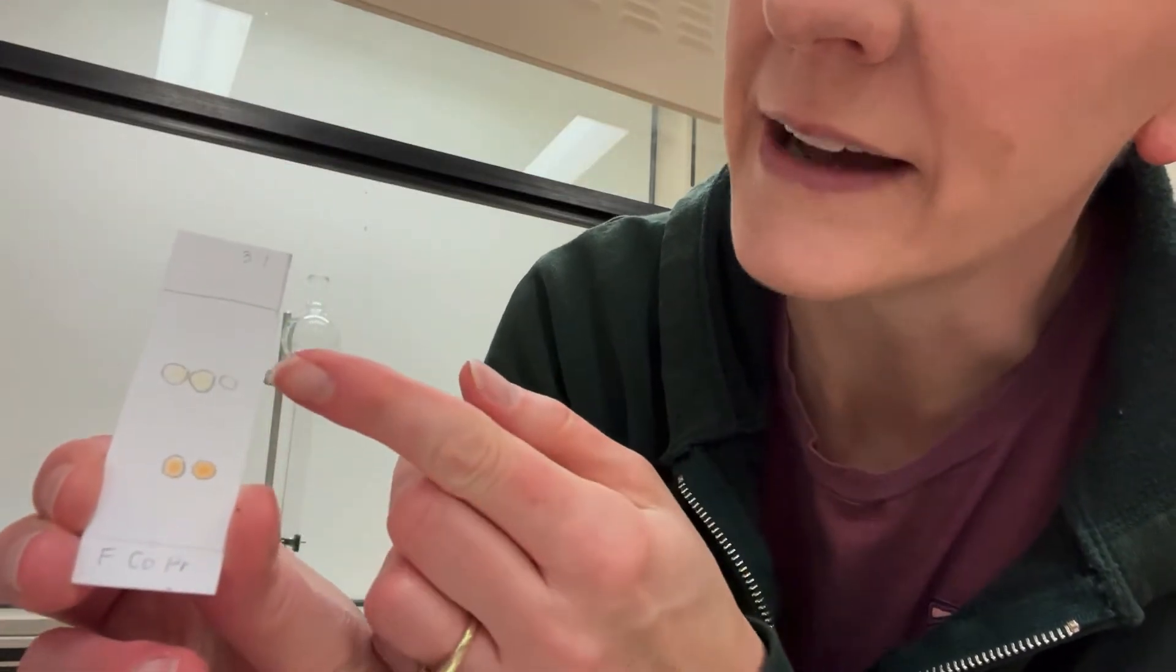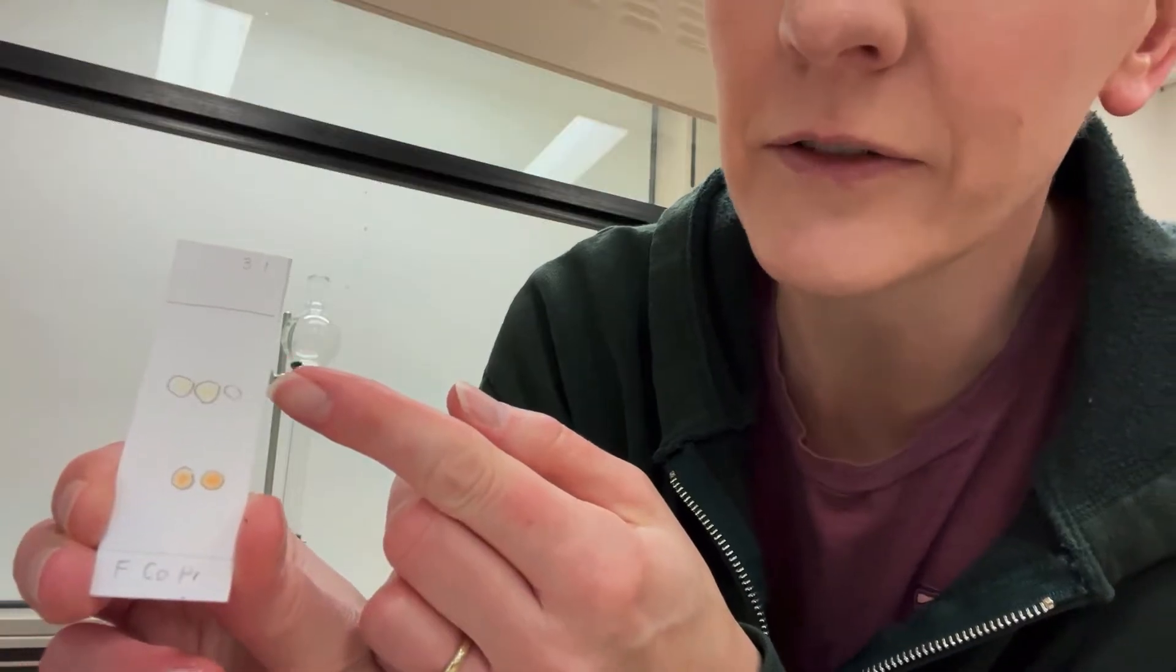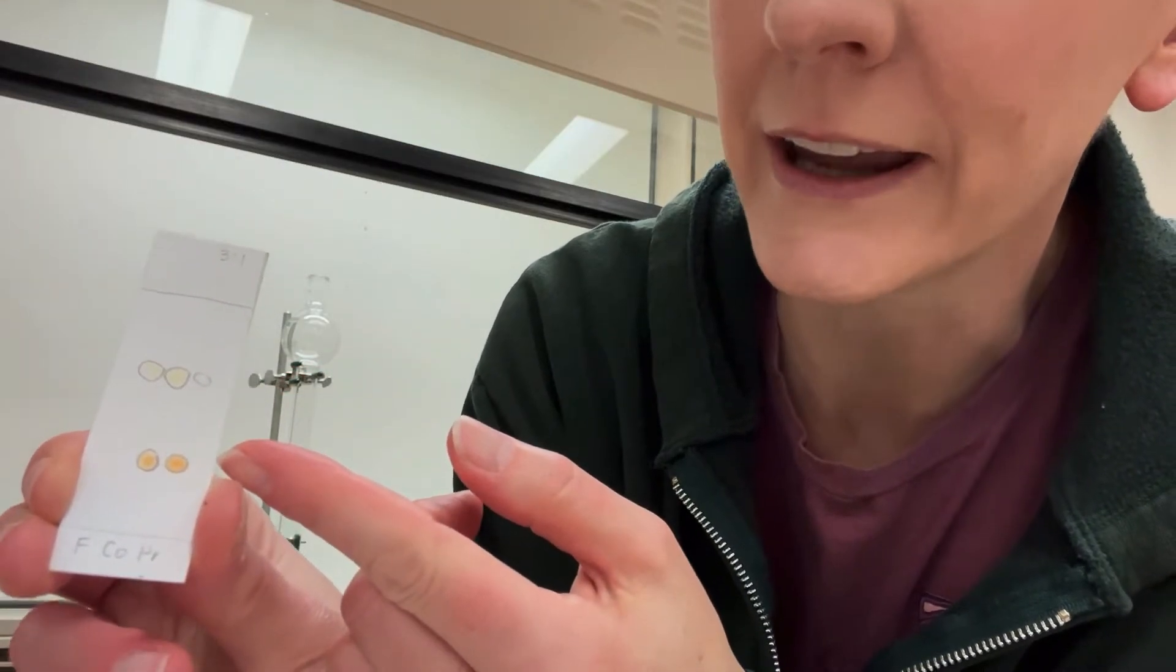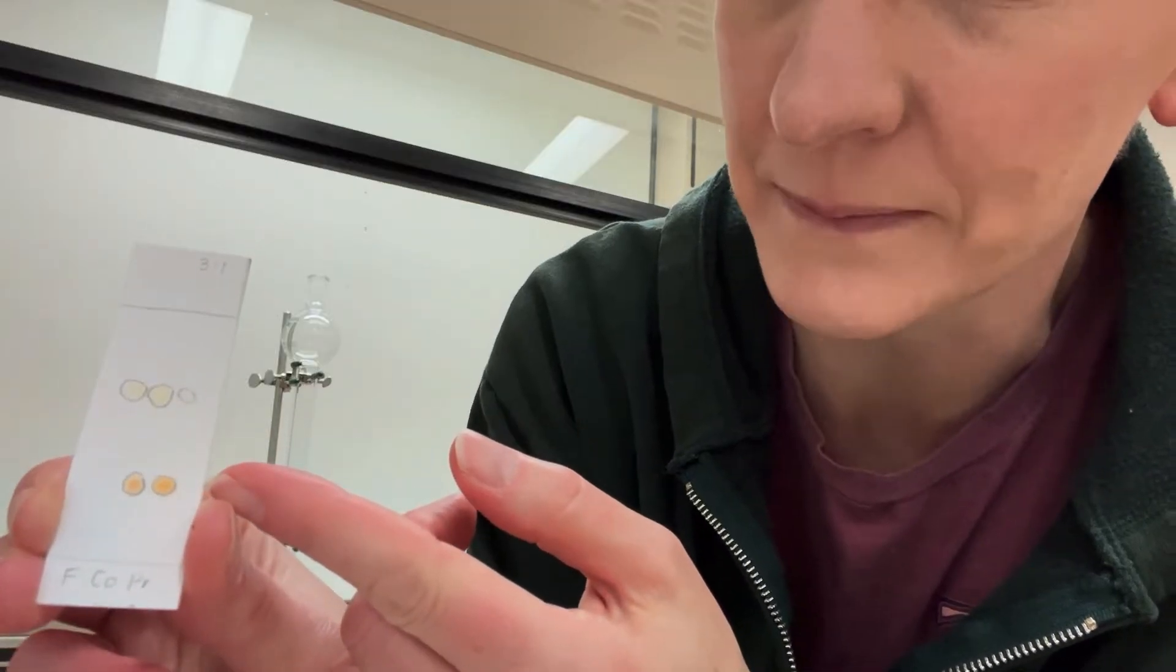So the TLC looks like this. In this lane I spotted ferrocene and that's that yellow compound up here. The middle lane is a co-spot and the other lane over here is the product mixture. If you notice, I have a small amount of ferrocene that's left over. That's what I'm going to be trying to get rid of and this spot is what I care about. That's the acetyl ferrocene.